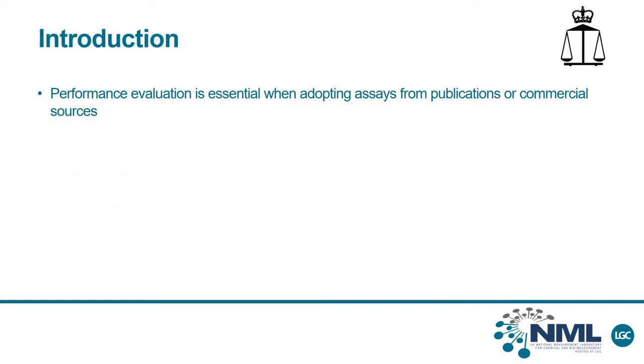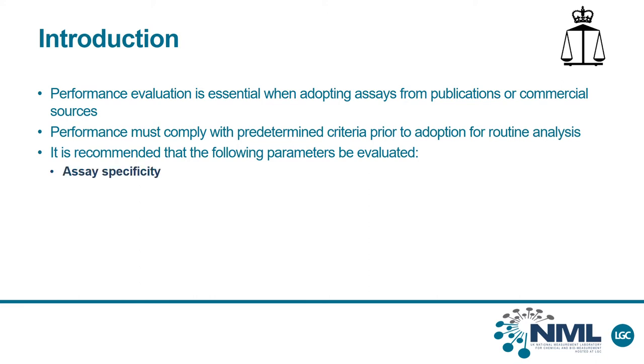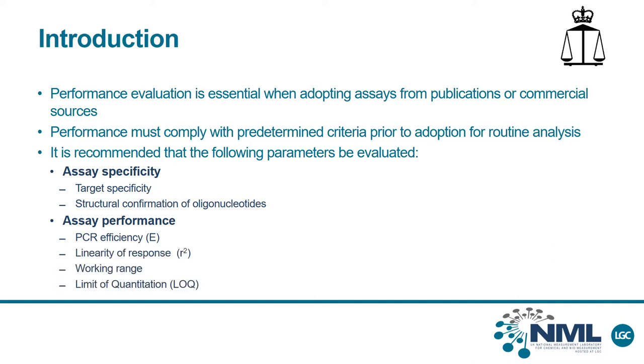Evaluation of an assay prior to use in routine analysis is essential in order to ensure that the results produced in the laboratory are fit for purpose, whether validating an assay developed in-house or verifying an assay adopted from alternative sources. A number of parameters may be examined in order to assess if an assay is fit for purpose. Those highlighted as informative in the scientific literature include those that evaluate assay specificity and those that evaluate assay performance.